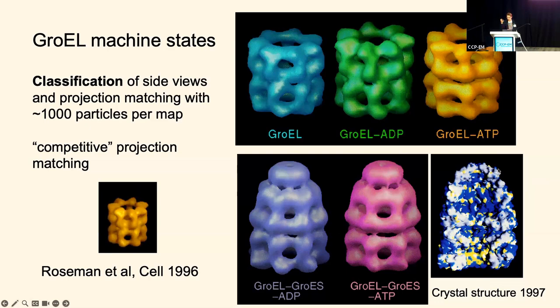It catches it on this nice hydrophobic surface inside the ring of the cavity. And then when you add GroES and ATP, there's a huge conformational change, and the substrate gets jammed inside a hydrophilic chamber, and it has no choice. It can either do nothing or fold, because there's nothing to stick to, and it can't unfold more because it's in a very confined space. It's about 70 angstroms high, that chamber. So that was a pretty good idea of how this thing worked.